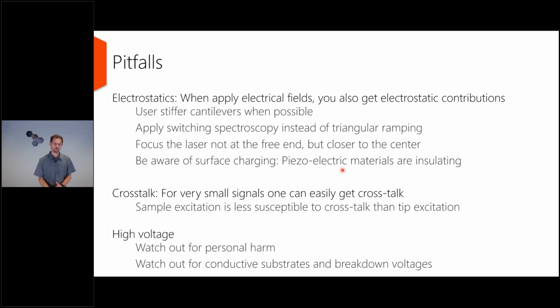If you introduce a surface charge, that may affect the electrical field through the sample, thus affecting your PFM response. But what we have seen is that afterwards, particularly if you are scanning and such a charged area is getting under the cantilever, it also affects the electrostatic contribution to the cantilever signal.